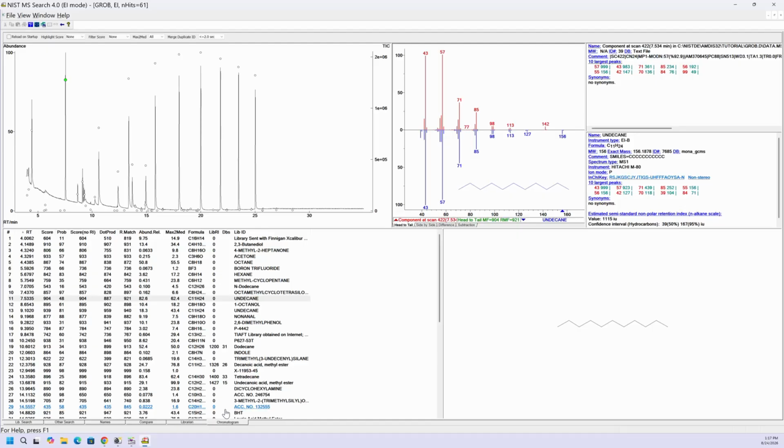So I hope you found this modification of the demo, so you could test it yourself, useful. And I hope you found the comparison giving you the idea of what the pluses and minuses are of the different software parts of the system, how you can search, whether it be vendor input or you just do it automatically now with this new chromatogram search that was only developed in NIST 26.